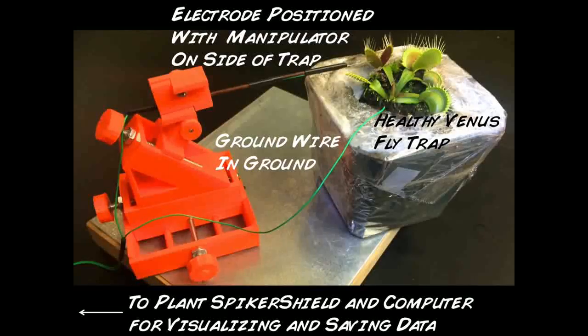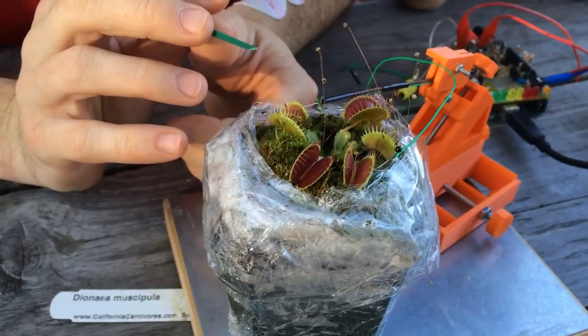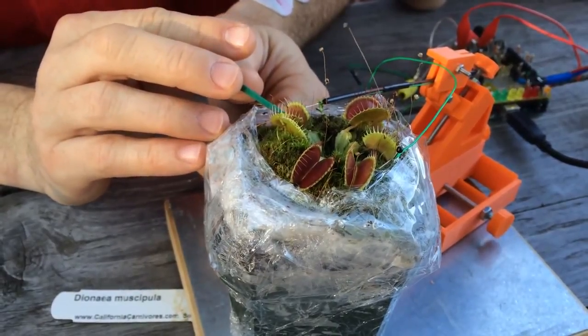Now that we're all set up, it's time to do some experiments. Inside the Venus flytrap, there are little trigger hairs that will fire a calcium action potential when they're touched. And although they last much longer, the spikes are very similar to those of neurons. The plant action potential begins the process of the leaf closing. In our first experiment, let's take a look at what happens when you touch a trigger hair.